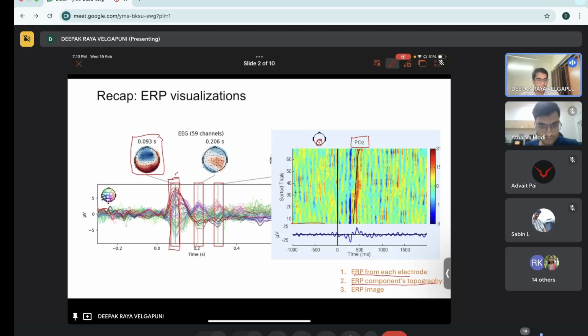So this black line you see, right? This black line here is nothing but sorted trials. So instead of plotting each trial sequentially, you sort it based on some metric in the task, and then you plot for each trial, which gives an ERP.